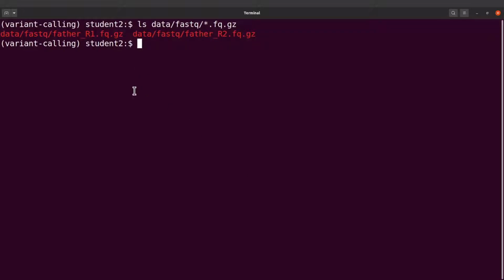There's something I want you to take a look at. Look at the file names here. You see what we have here. You also see this. So in my opinion, these are long file names. So what we will do is to assign these names to variables so that we will have the names shortened for us. So we will do that.